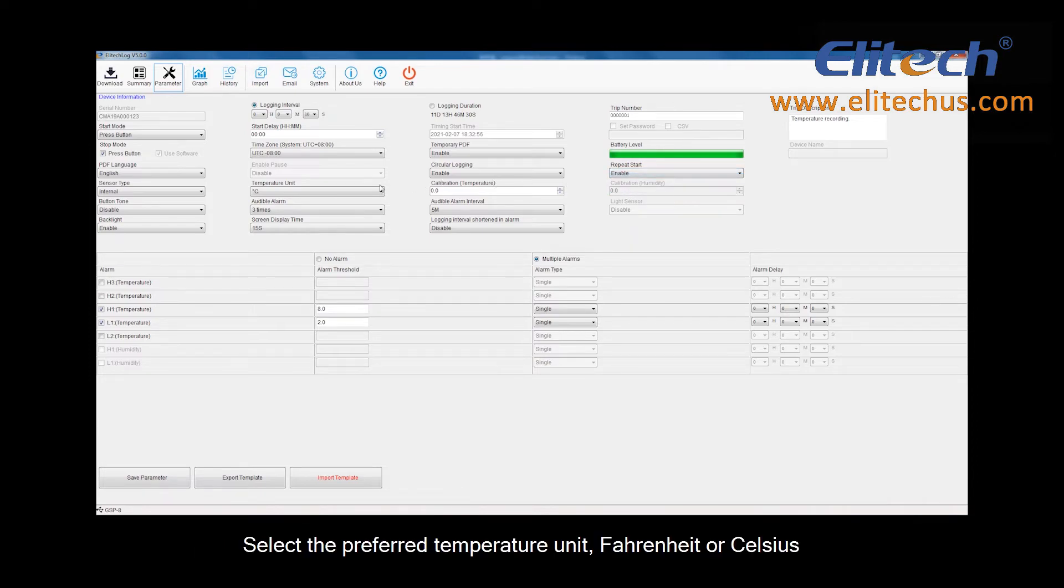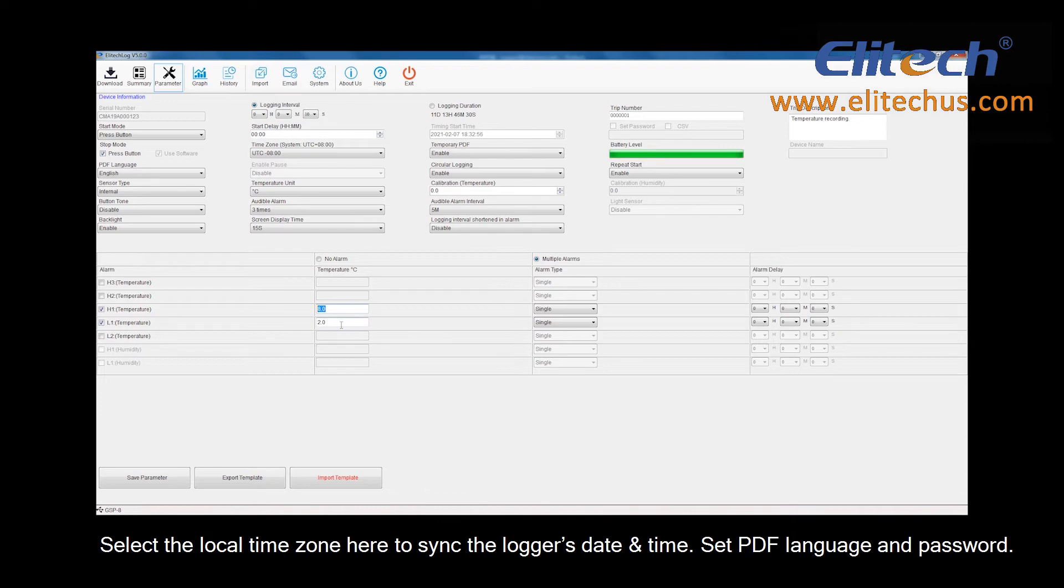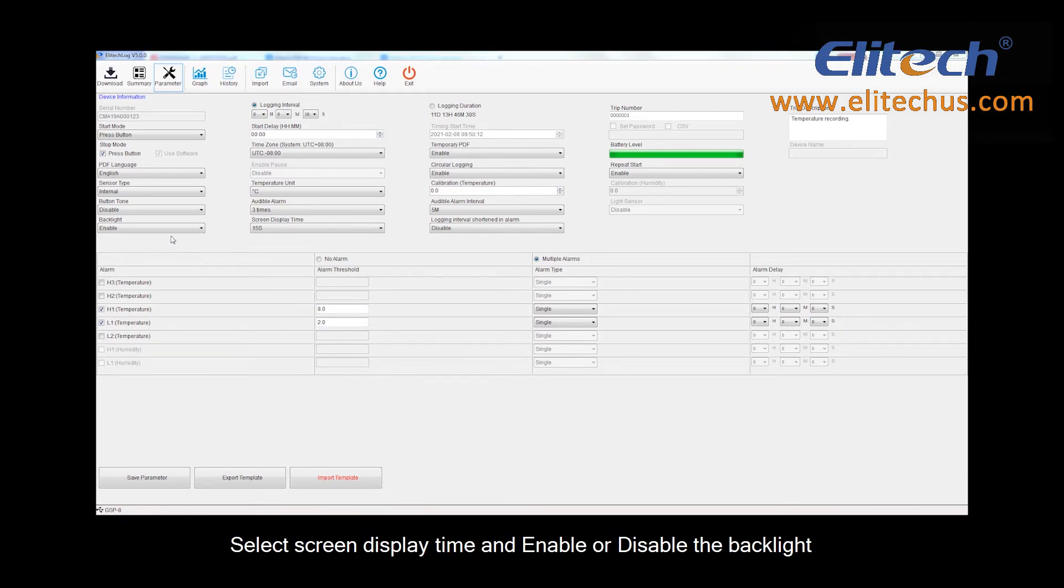Select the preferred temperature unit, Fahrenheit or Celsius. Select the local time zone here to sync the logger's date and time. Set PDF language and password. Select Screen Display Time and enable or disable the backlight.